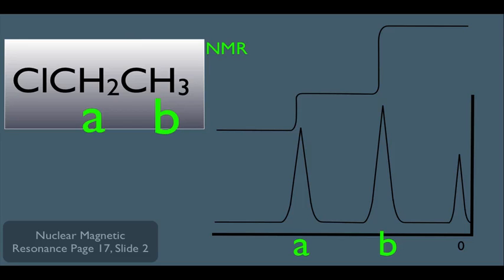Whatever area it has is proportional to the length of this line. And the area under the B peak is proportional to the length of this line. If you were to take these two vertical lengths right here and compare them to each other, you'll notice that the A length is 2 to its 3. This means if we have this line in our NMR spectrum, we can take out a ruler, measure their relative lengths, and that could give us a particular ratio. And again, that ratio would match the ratio of hydrogens in our sample.